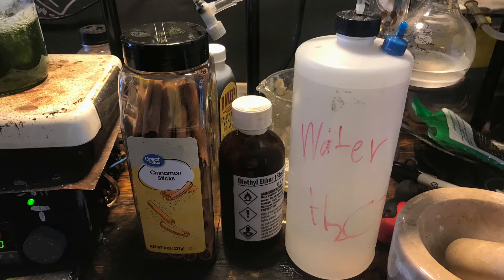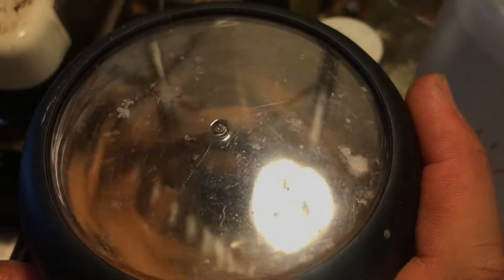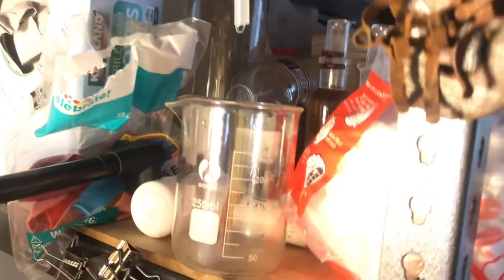You need cinnamon, an extraction solvent — chloroform and ether both work very well — and water. That's literally it. First, grind your cinnamon into a powder. I have about 88 grams here. Sorry for the sideways footage — I can't really do anything about that.